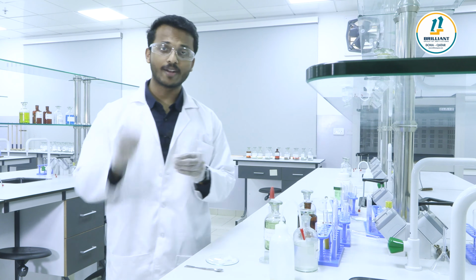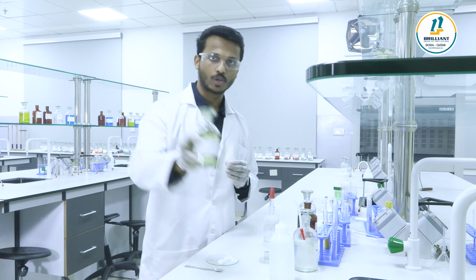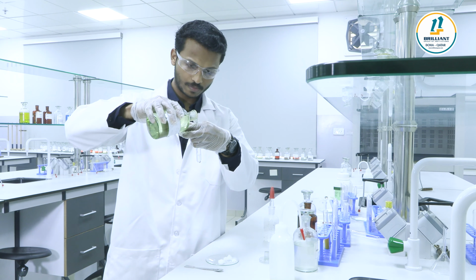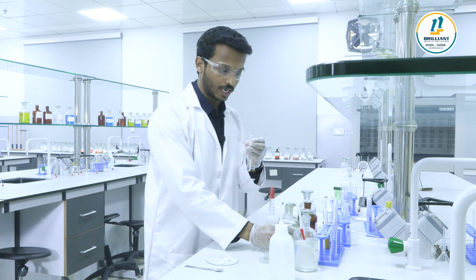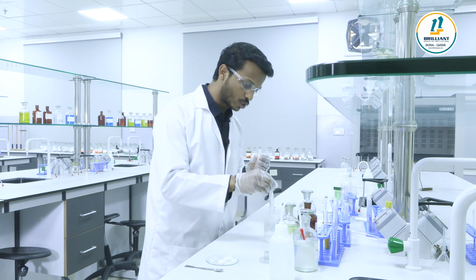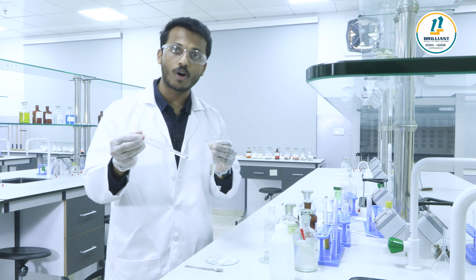To which let me add freshly prepared ferrous sulfate, a pale green colored solution. Freshly prepared ferrous sulfate solution, we have to add. Now, dear all, don't shake the test tube. Without shaking the test tube, you have to add concentrated H2SO4 through the side of the test tube. So, how to add it very carefully.